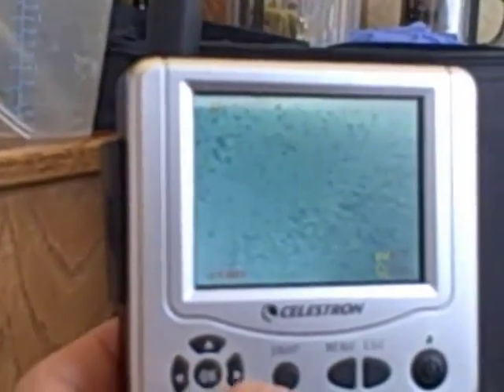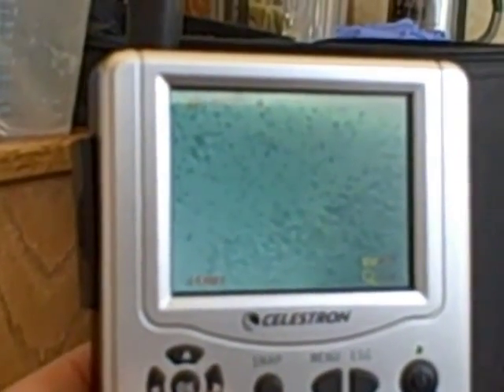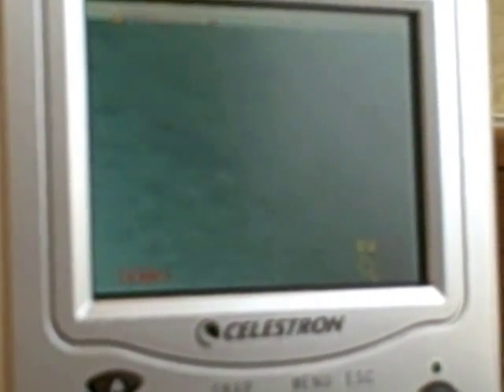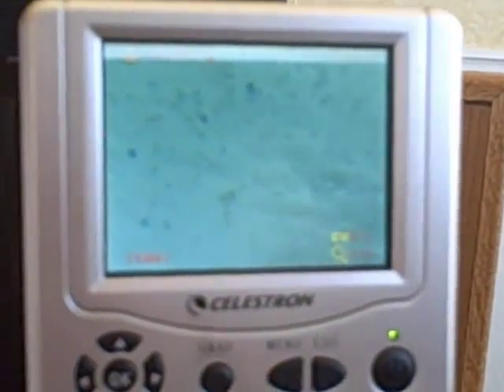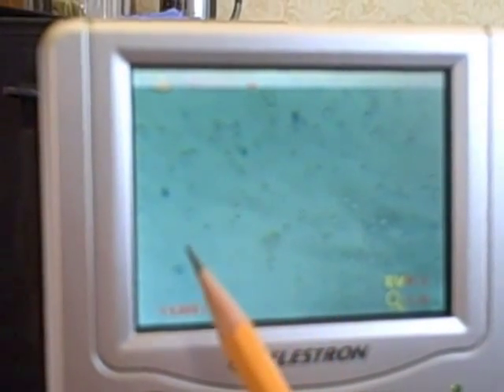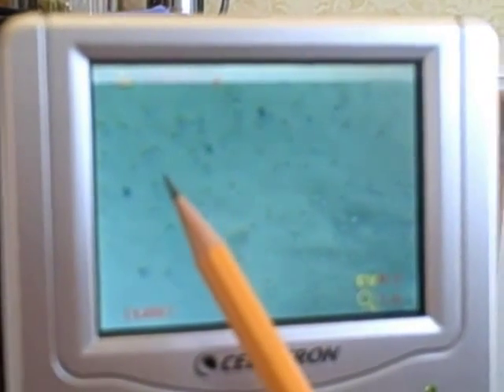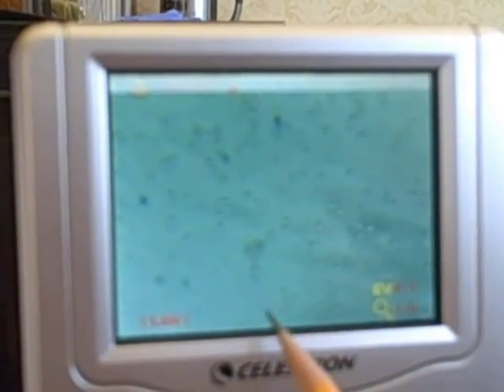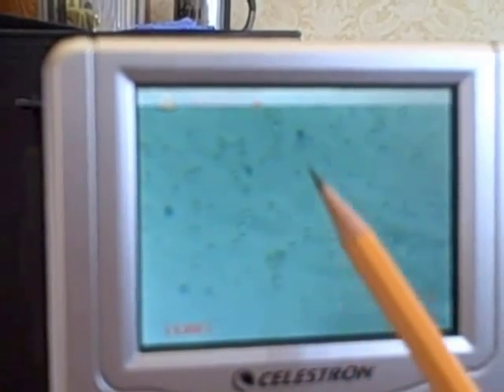There we go. I'm going to zoom in. What I'm trying to find is the grid, which is kind of light — darken that up. What I'm trying to find is that one, the first corner. So what we have is one of the grids. This is the bottom left corner. You'll see here's triple lines, triple lines, triple lines. And then there's 16 squares in between.